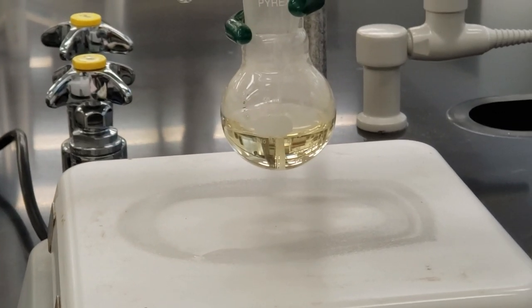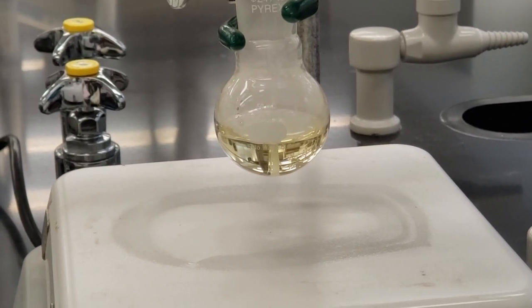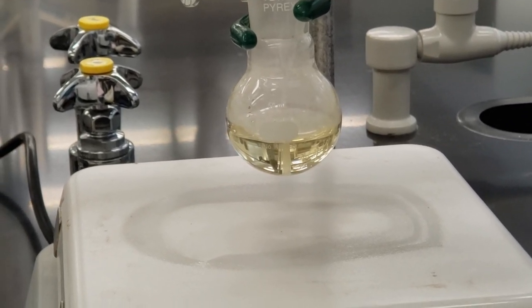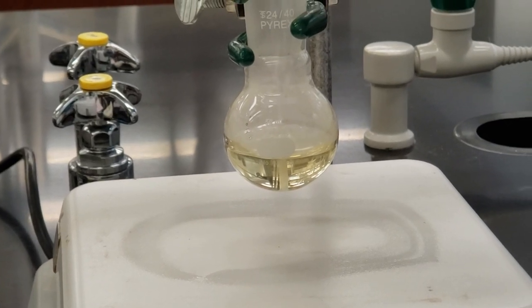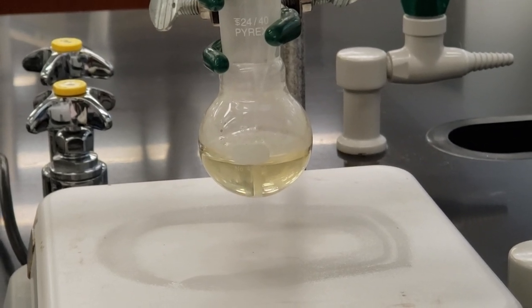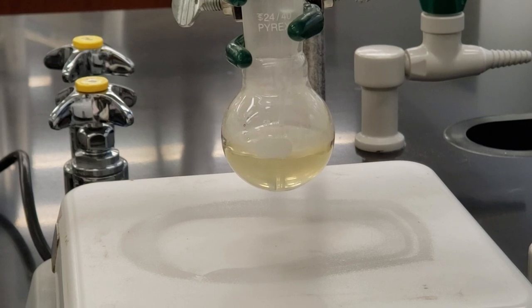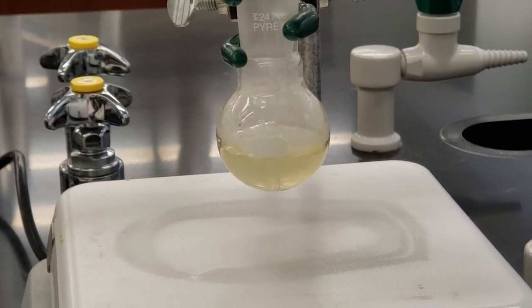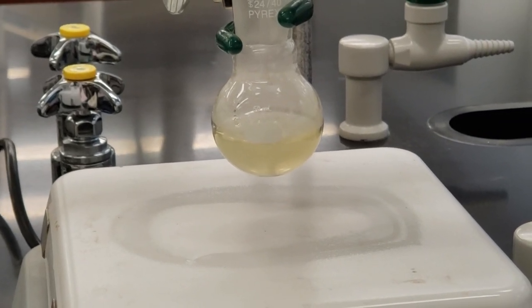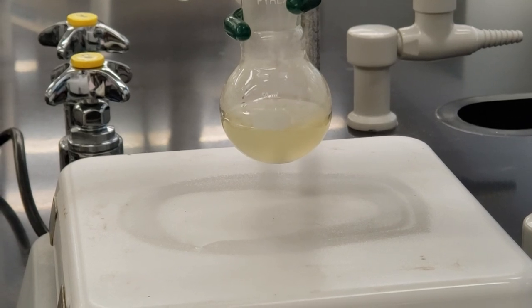We don't want to do this too quickly. If you can see the vapor evolution that's happening, the clouding of the glass. We don't want to do this too quickly, otherwise the reaction can get very violent. We're just going to do it slowly. Stir it just a little bit here. Try and keep the solution clear, although it is going hazy on us pretty quickly.